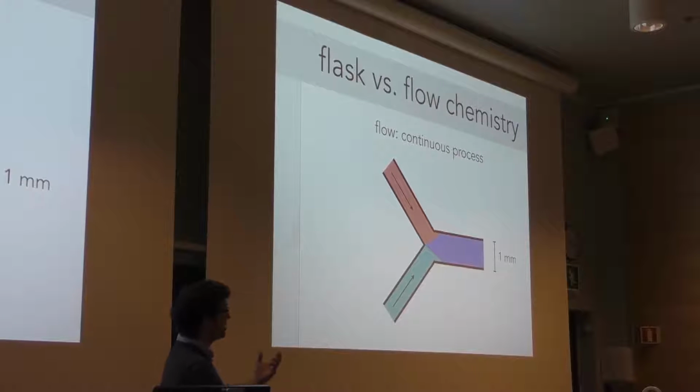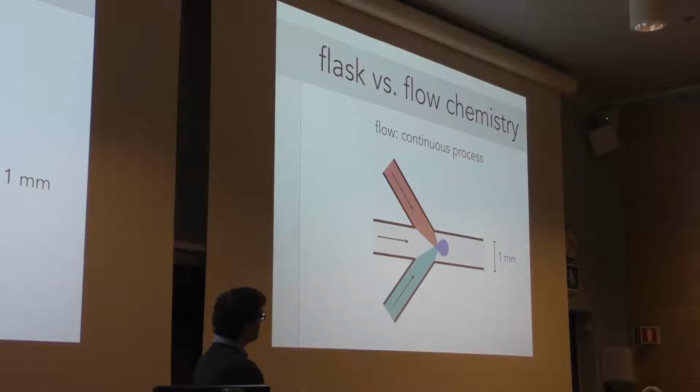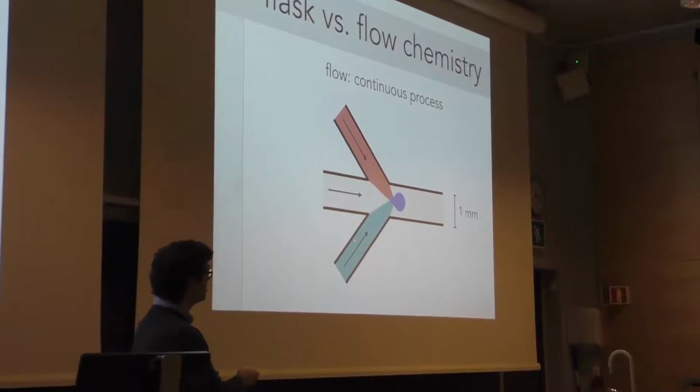Also, as that reactor is fouling up, the properties of the reactor itself, so the volume of the reactor, is changing. It's ever decreasing in volume, and so your reaction environment is no longer stable. So the way to get around this, the way we developed, was to incorporate a fluorinated oil. So this is a perfluorinated polyether that we inject in alongside our 2 reagents.